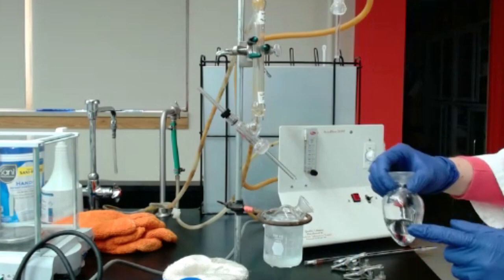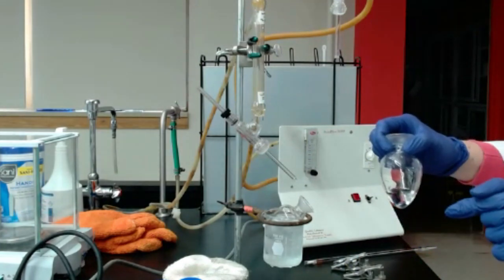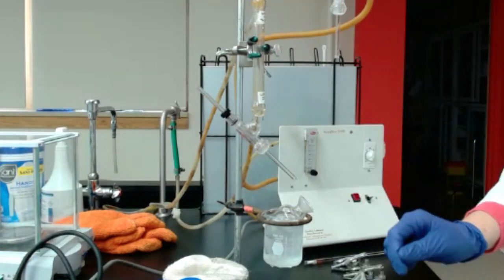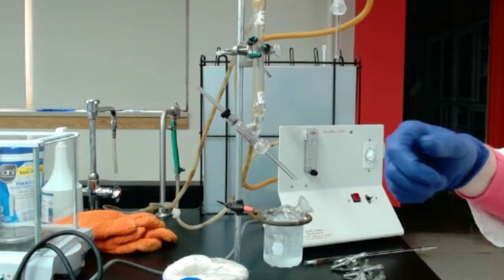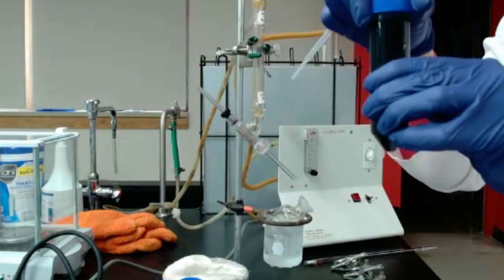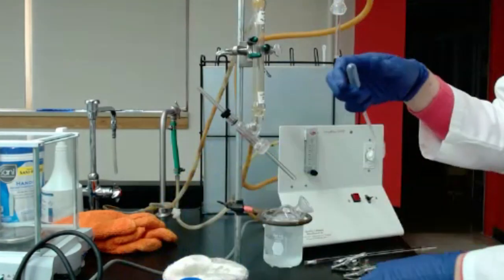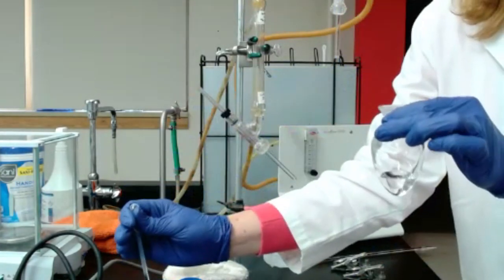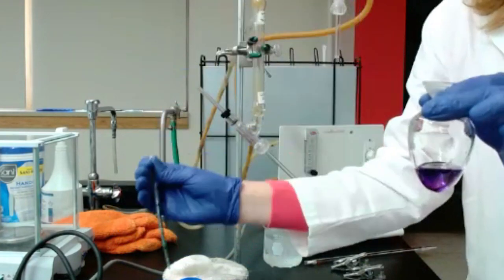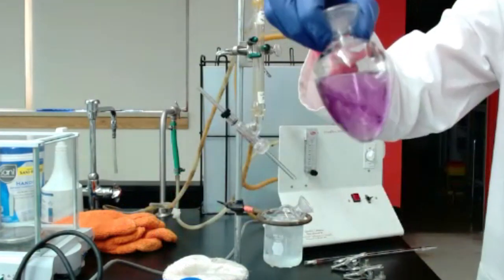Then we need the color indicator, because that's how we're going to see when it's done, and that's how we're going to do the titration based on color. So I will use a plastic pipette and take 3 to 4 drops of that color indicator. You will see that the goal is to have a clear pale green. Oops, I put a lot, but you can see it's not green, right?